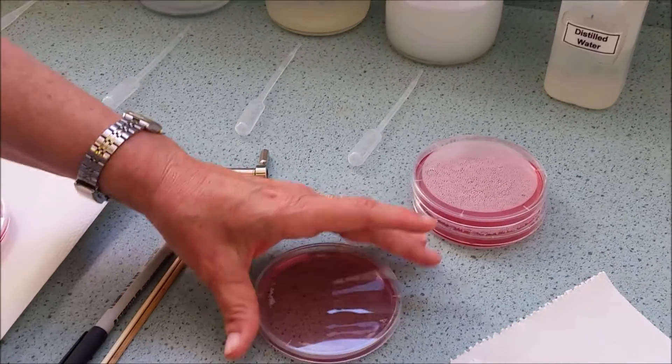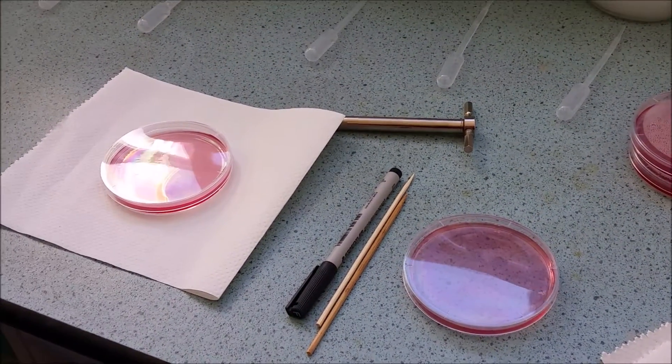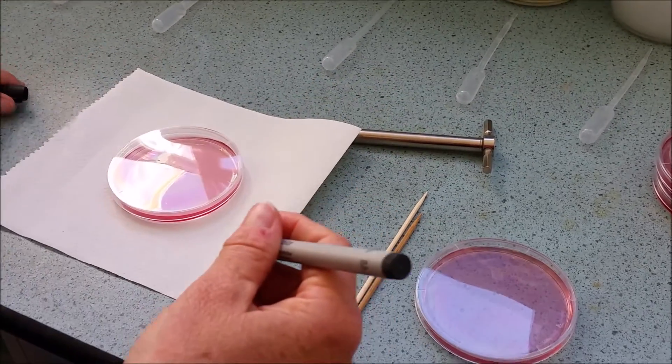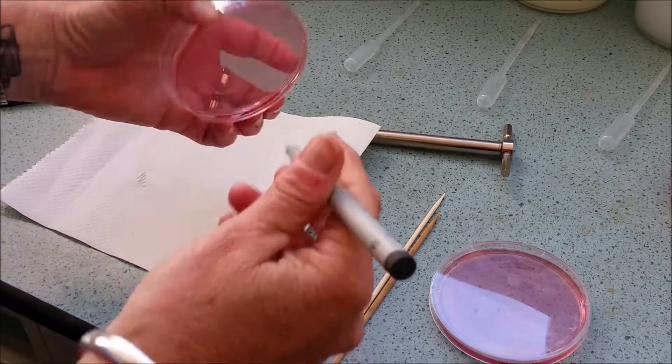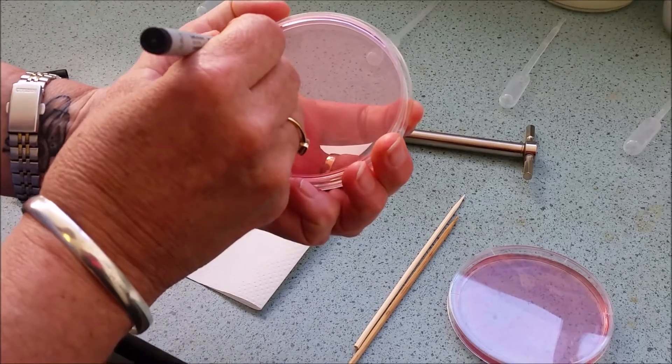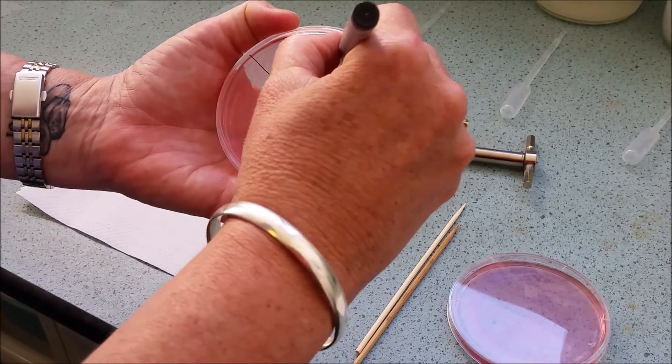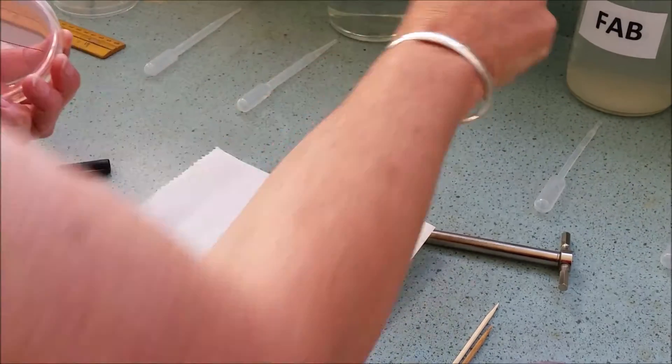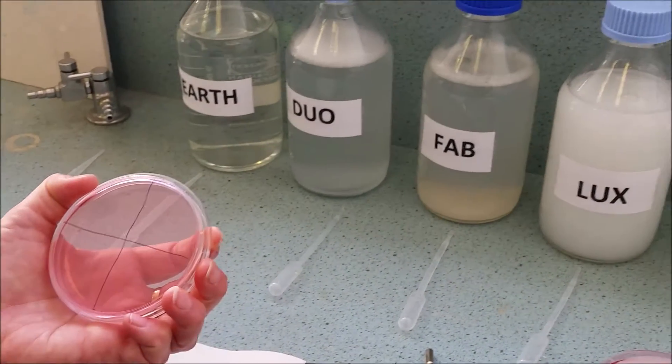Once that's done you'll have two petri dishes as I said. The next step that you need to do is to use your black marker pen to very carefully on the underside of your petri dish to divide it up into fours. And then label each of the laundry detergents that you'll be using in each of the squares.